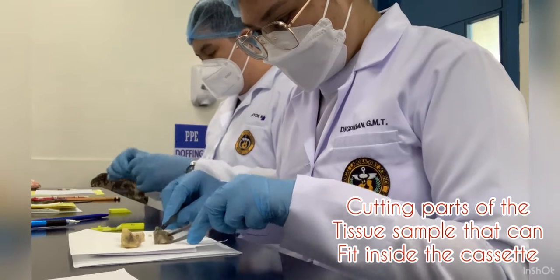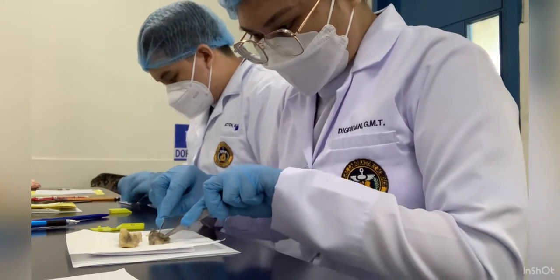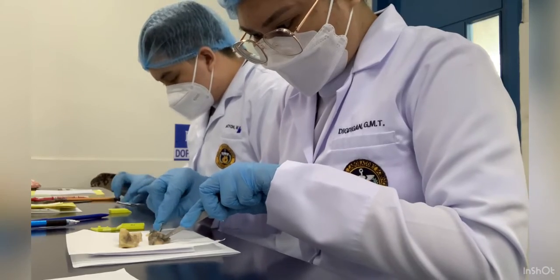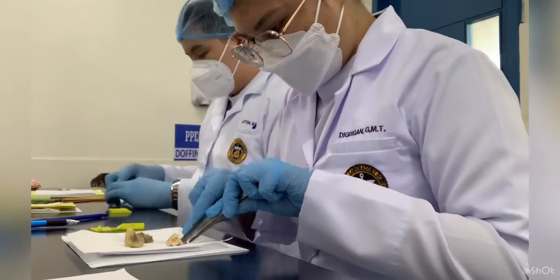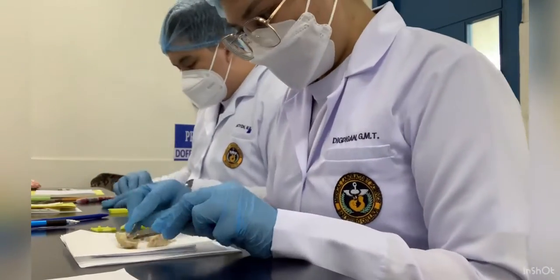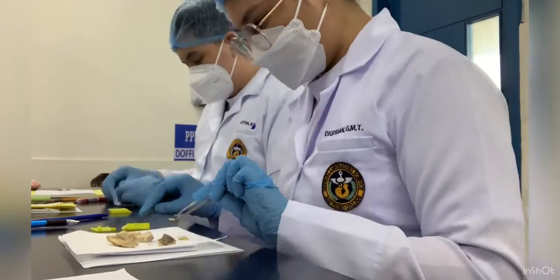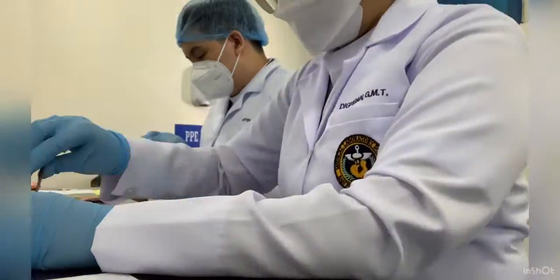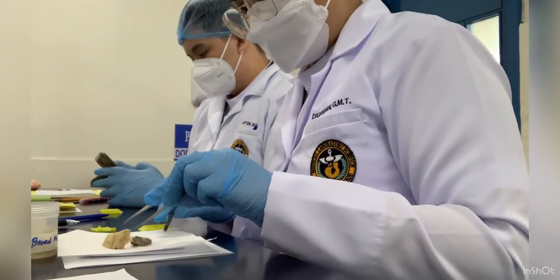After measuring, next is cutting the parts of the tissue sample that can fit inside the cassette. After cutting, return the tissue in the container.